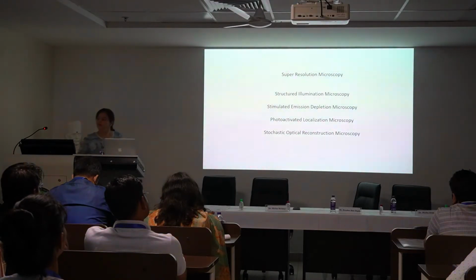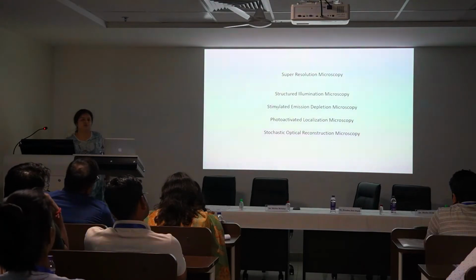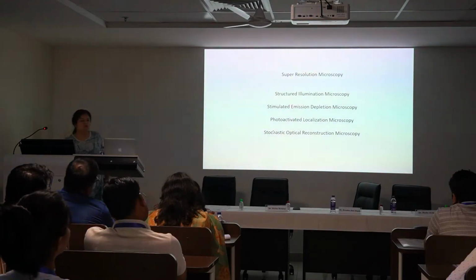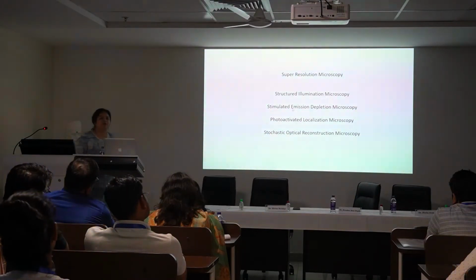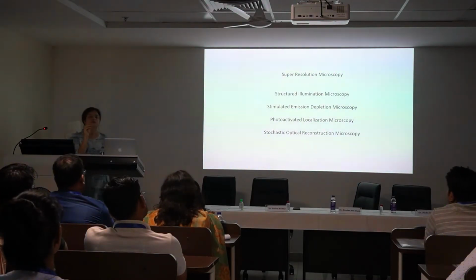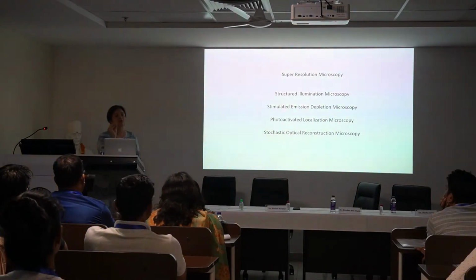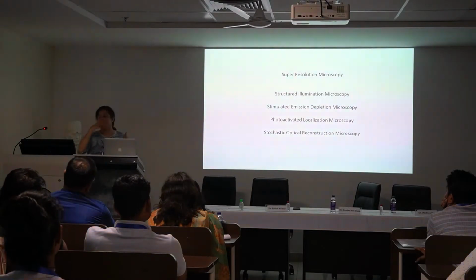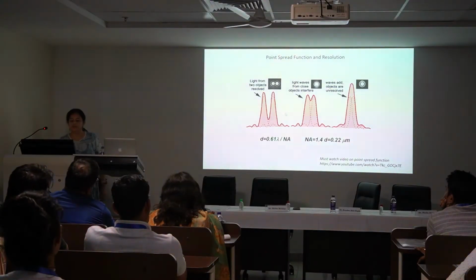So one thing to note, which is the difference between STED, which is right here, and PALM and STORM, as they are called, is that in the case of STED, the goal is to capture photons from a very, very small region of interest. We saw the region that is shown by these particular peaks.